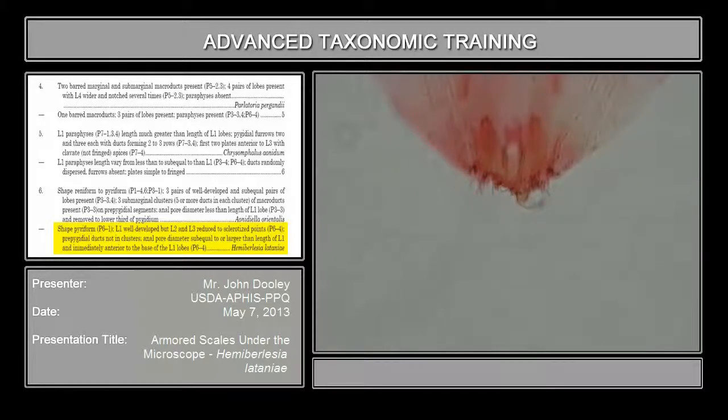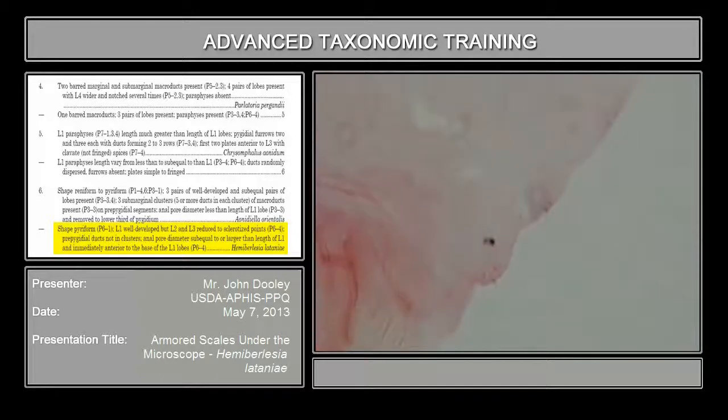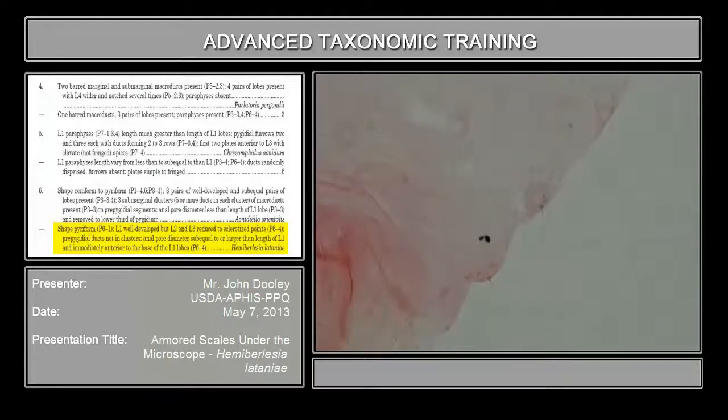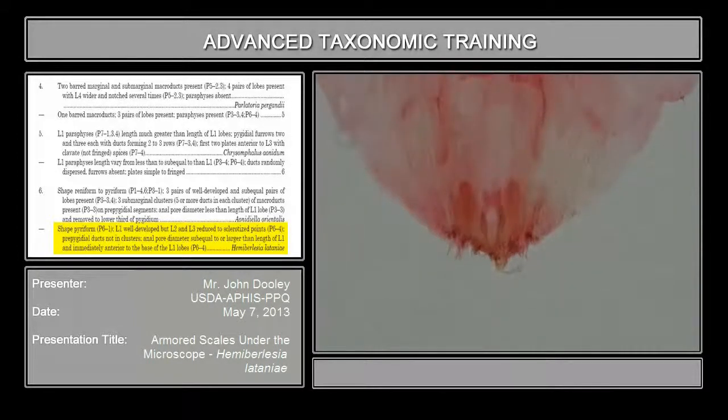So look at yours and see if you can see any lobes at all. L2 and L3 will most likely look like little spines — a conical spine. L2 might have a notch on the side of it, or may not. And if you recall the three clusters of ducts on the prepygidial margins on Aonidiella orientalis, you'll notice this may have some ducts but they're not in clusters and they're very small going up the pygidium. In fact, some of these are even seedy too.